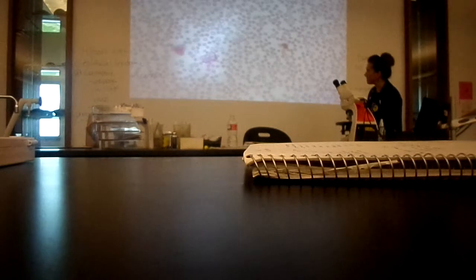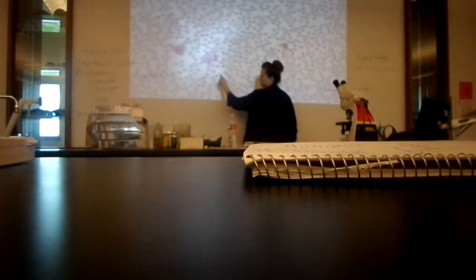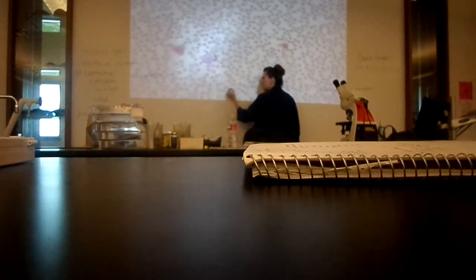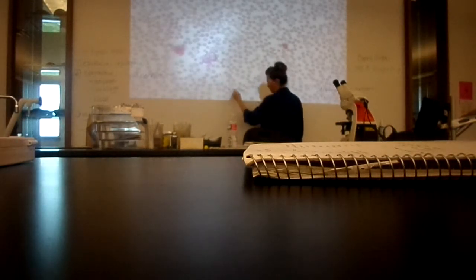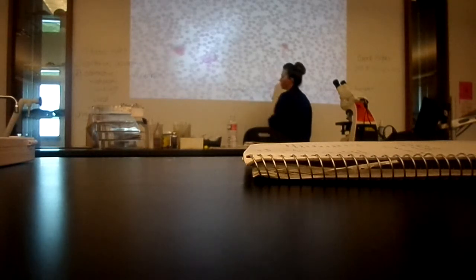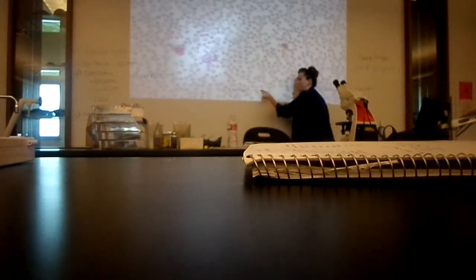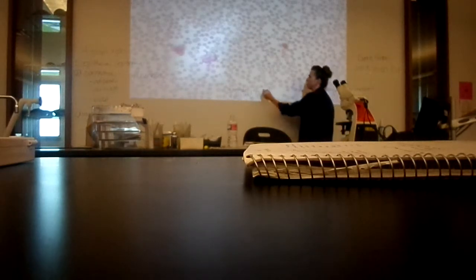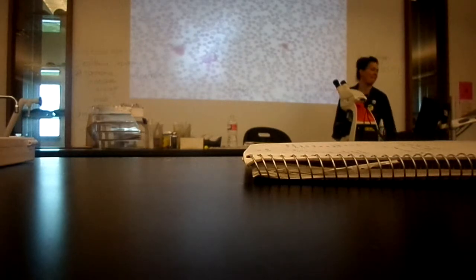Then you're going to see these teensy specks. Little dots. Those are little fragments of cells that are called thrombocytes, or platelets. Can we just use platelets? Thrombocytes, okay, not 5th grade. What's the function of a thrombocyte? Blood clotting.